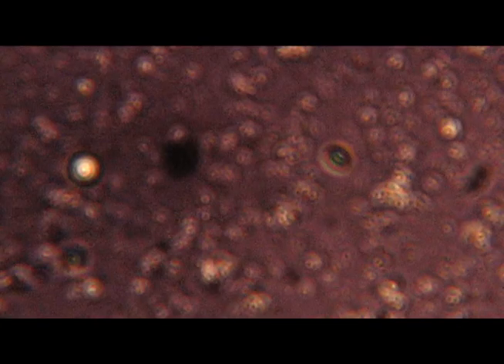Seen here is an image of a negative stain. Notice how the stain surrounds the bacteria, making them easy to identify.